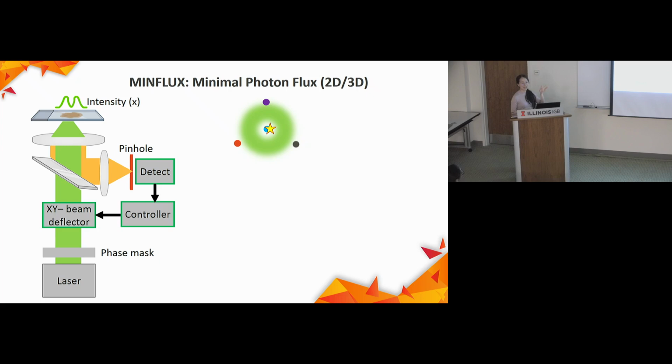This is the first scanning. You're scanning in a big range to localize, like, vaguely the position. And then you can always shrink the scanning area to make it smaller, and then you can localize it more precisely, and then scan it even smaller to localize it very precisely.